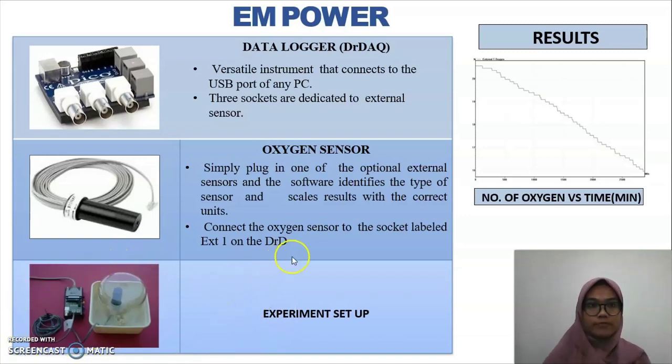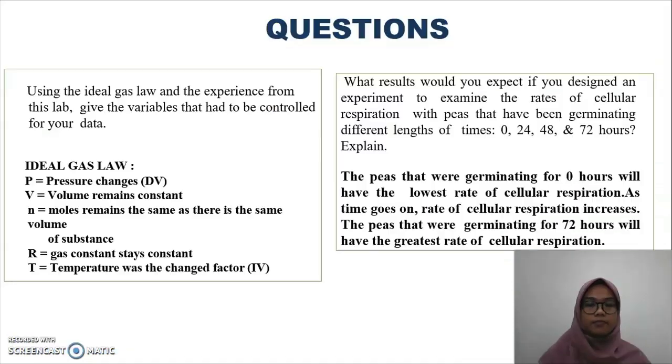The next one is the result of this experiment. As the time increases, the amount of oxygen will decrease. In this phase, there will be a few questions that will be asked to the students to increase their understanding about this experiment. This is an example of the questions.